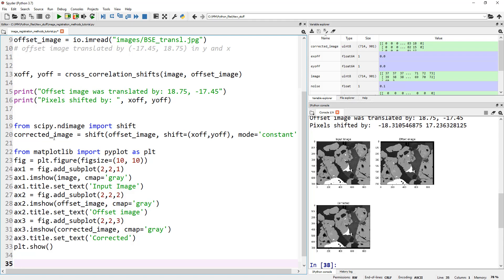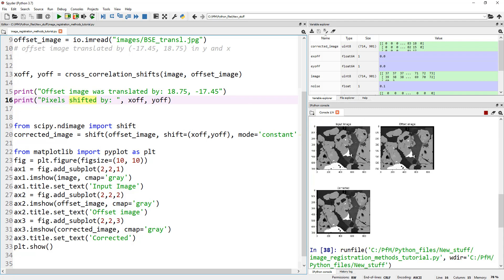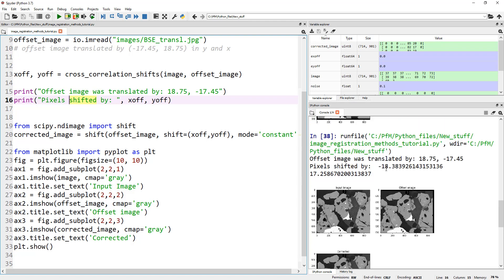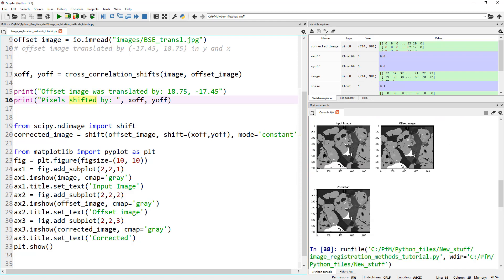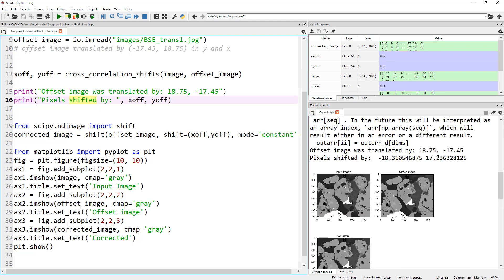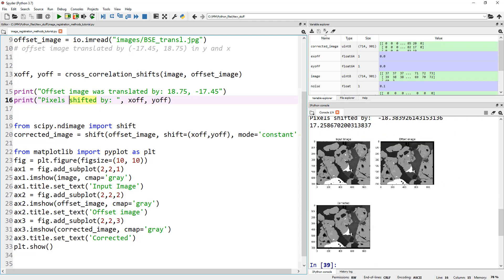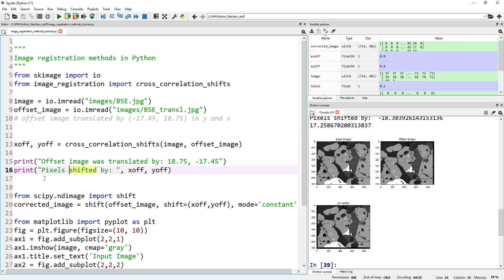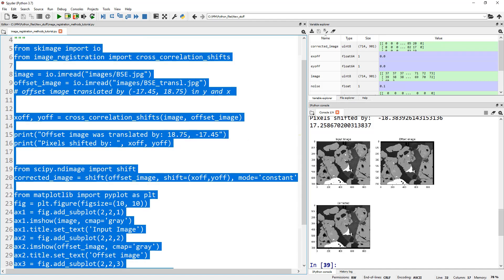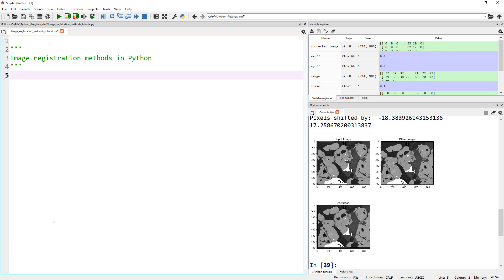We are printing our offset, the shifted pixels, and we are shifting this back to our original. Let's run this. With cross-correlation, for this specific image, it's saying 18.38, and the original was 18.75. 17.25 versus 17.45. I think it's very similar to the previous result. We got 18.3, 17.23. Here we got 18.38. These both are similar. It depends completely on your images, so go ahead and test these two on your specific images. These two were inspired by the astronomy community.